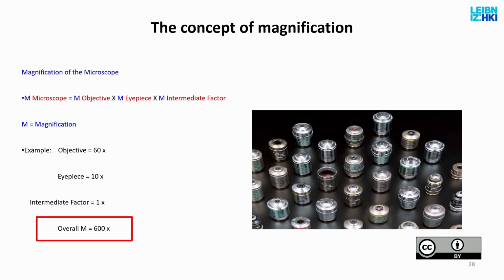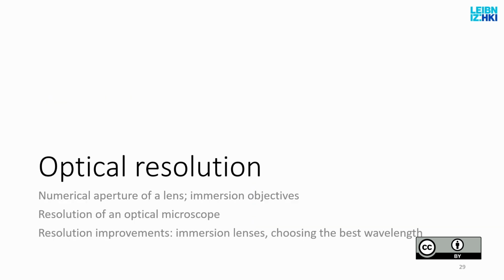You will see this very soon, that if somebody comes to you and says, okay, here is a microscope with a 10x or a 5x magnification lens, I want you to examine phagosomes during phagocytosis in a cell, you say, I cannot do that. This lens is not designed for such high magnification work. It doesn't have the power, it doesn't have what you will learn to be called the resolution. But for that, you need to know how the lenses work, and you know this now, and what these parameters mean and how to look them up.